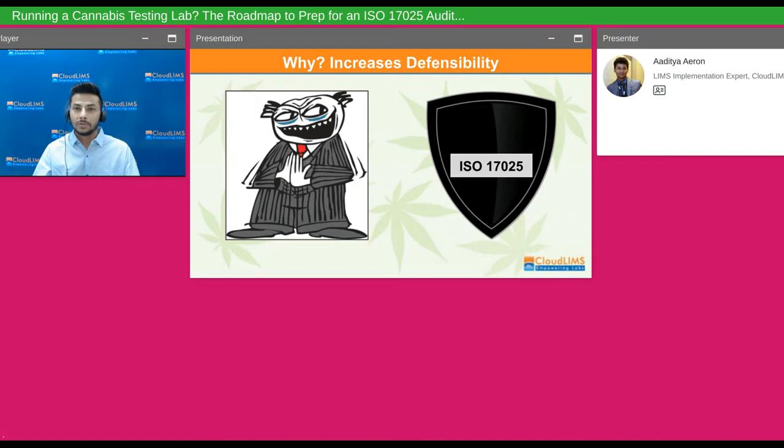What you can do is, in your LIMS system, you can take them back to the very starting point of things, which starts from the correct environmental conditions in which the test was conducted, the correct sample amount that was accessioned to the system, or that you have your correct people working on the said testing. You've also got predefined SOPs, which can of course guide technicians to take the right actions.